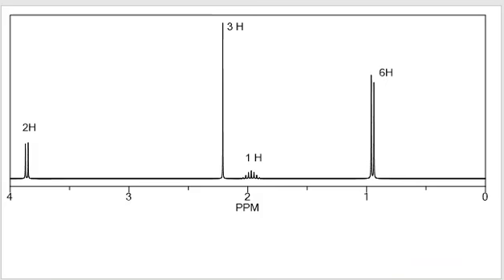In this method, the data is tabulated, and then chemical shift and integration data are combined to propose small fragments or pieces of the molecule, which are then linked together using multiplicity information. So it's not ever going to be possible to solve all of the structures with this procedure, but we can solve many of them.